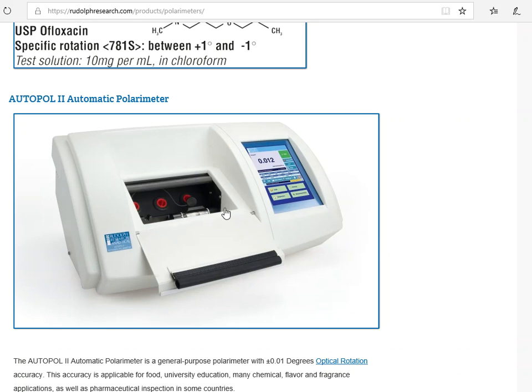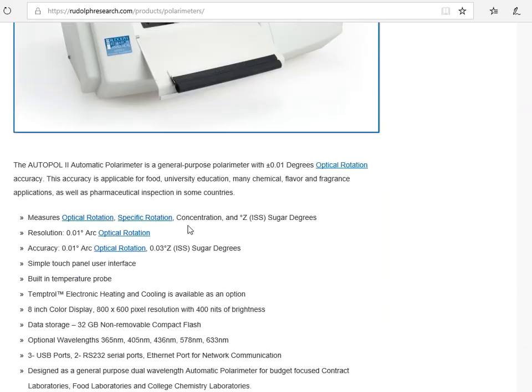You can put it up here to the top. You can push it back here to the back. You can keep it right there in the middle. It doesn't really matter, quite honestly. It doesn't use distance as a measurement of anything. So wherever you put it, you should get the same readout. I just like to be consistent when I do them.